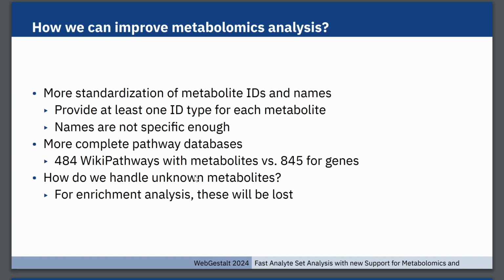how well your IDs are. Do you guys want support for multiple ID types? Like for us, it's usually all gene symbol or all KEGG IDs, but sometimes you may have metabolites that don't have any PubChem annotation, but some others do, so you have a mixture of IDs. So these are a lot of features that we would like to collaborate on. And I think generally, the biggest area for improvement is this unknown metabolites and how do we expand on that.